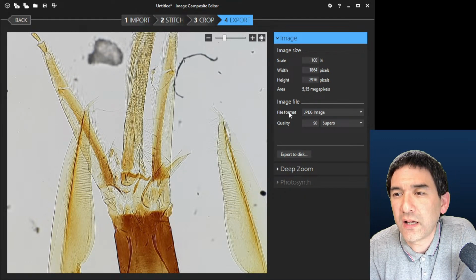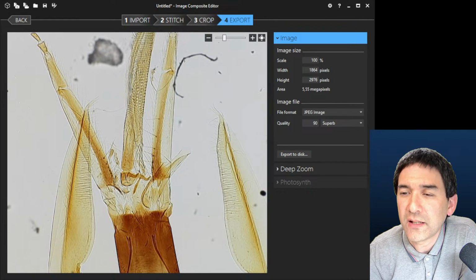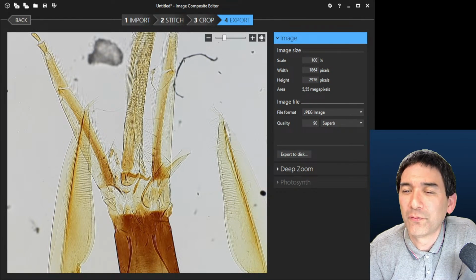So let's have, over here, a question about micrometeorite hunting: is there something more or less easily accessible that I can use for making insects transparent? Oh, yeah, already answered that. That's some potassium hydroxide. So that's the next program for my work.